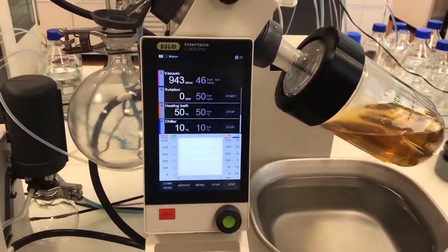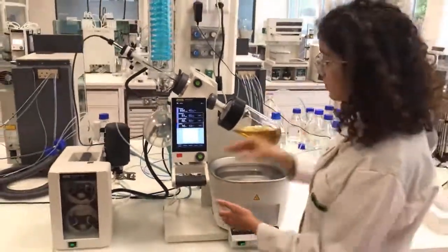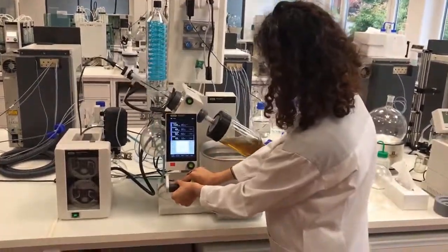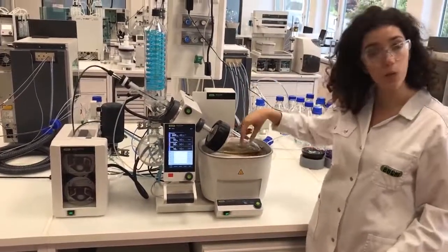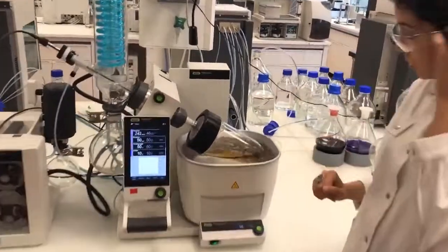So now we're going to start the distillation. As you can see, it starts rotating. I will immerse my flask now. When you immerse your flask, please make sure that this part is not underwater. Now I will ask you to come a bit closer.